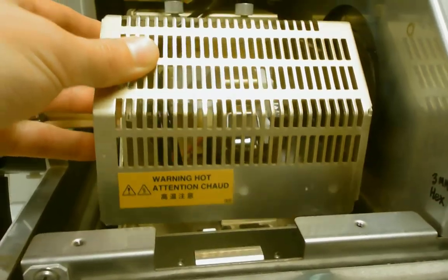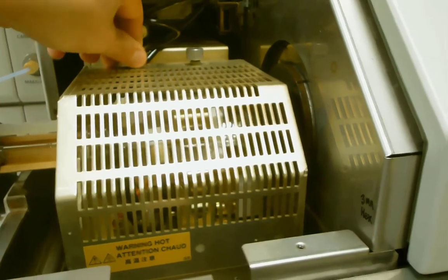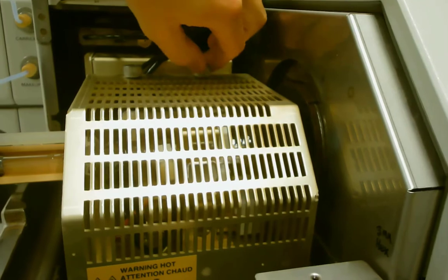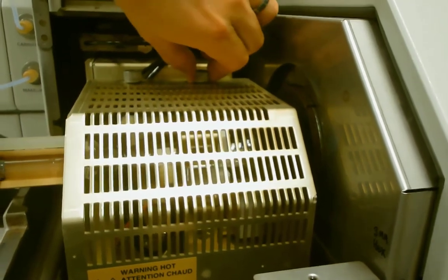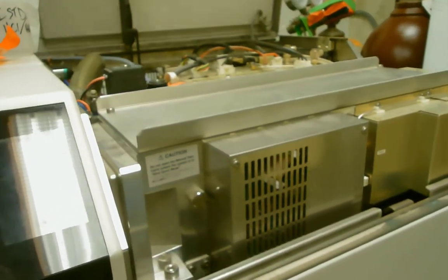So we can't actually look inside the vacuum chamber because we don't want to open that up. First of all, venting it takes a long time, and pumping it out again, but you don't want to open vacuum systems unless you absolutely have to. But we can look under the cover here a bit and get an idea of the layout.